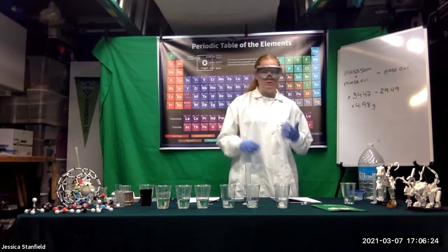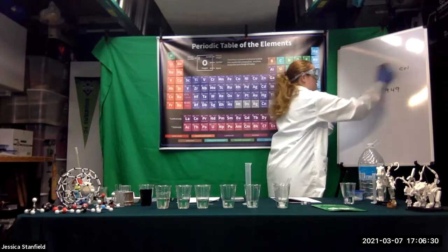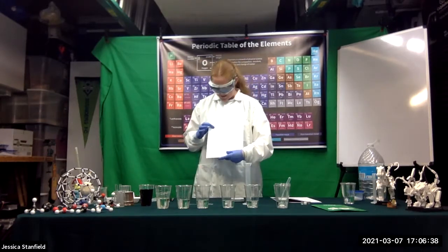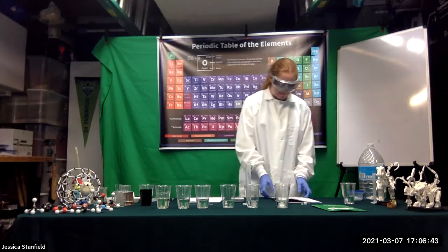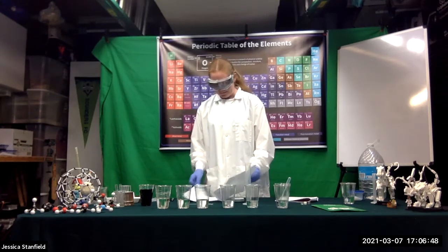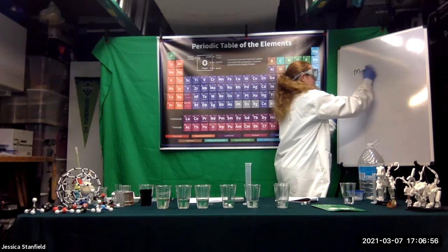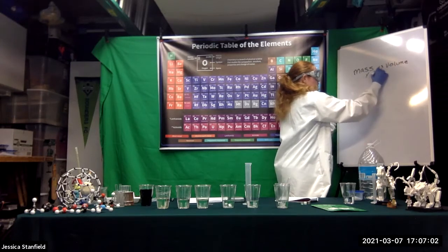And then what you'll be doing is graphing this. Okay, rather than calculate the density of each of these by hand, we have this data table. Right here, data table 3 has percent of sucrose in solution, equation, and then density. So what you'll be graphing is your mass versus your volume, okay? So our mass versus our volume. And this is Y versus X.